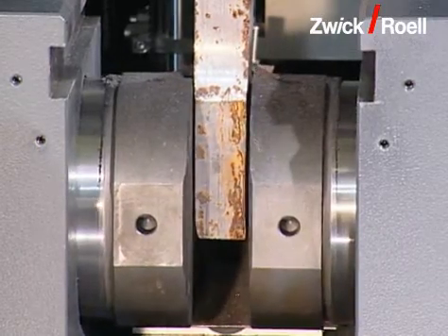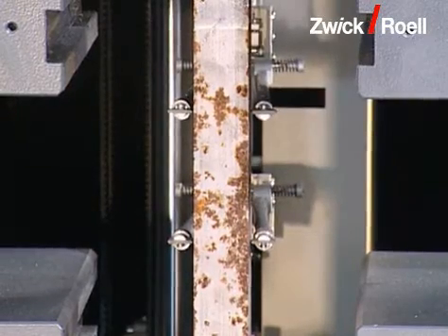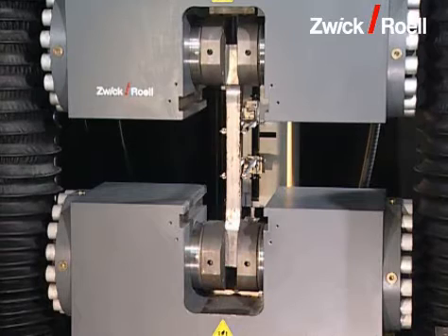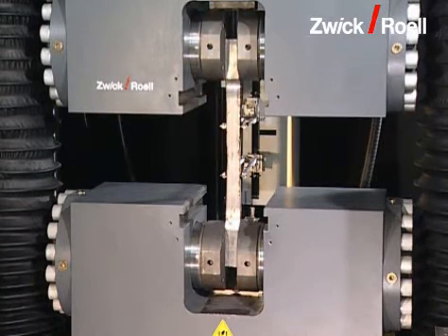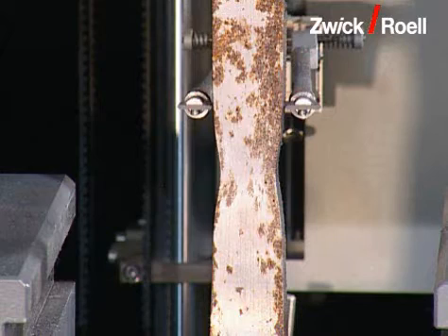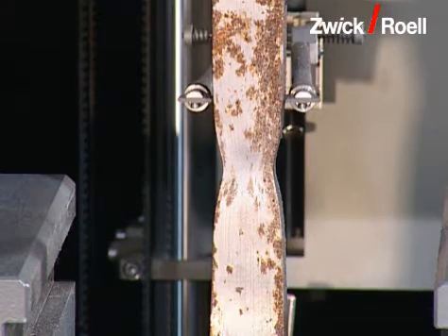First, the double-sided grips close. The extensometer is brought into position. The tensile test starts automatically, here shown in fast motion, and runs until the specimen breaks.